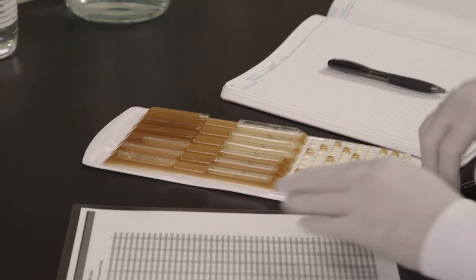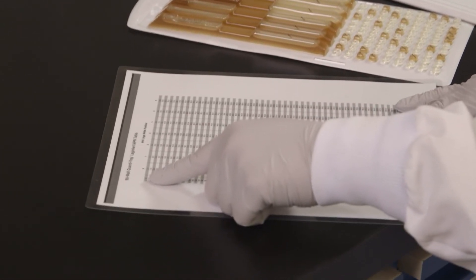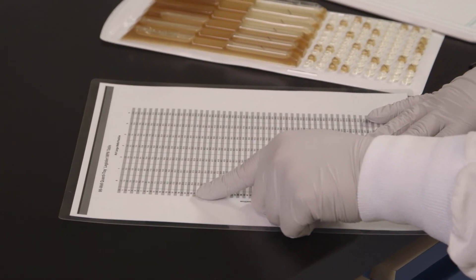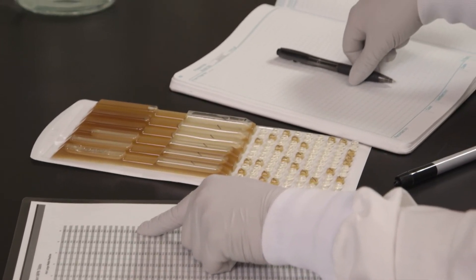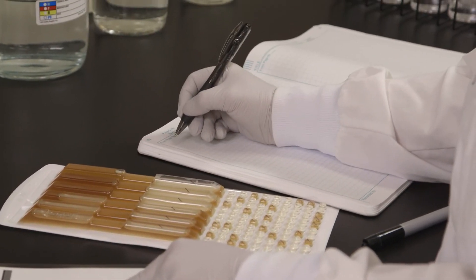The most probable number for this example is 156.6 multiplied by a dilution factor of 10 to achieve a final MPN of 1,566 per 100 ml.